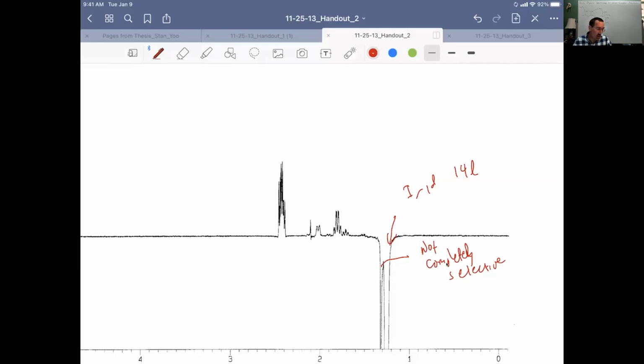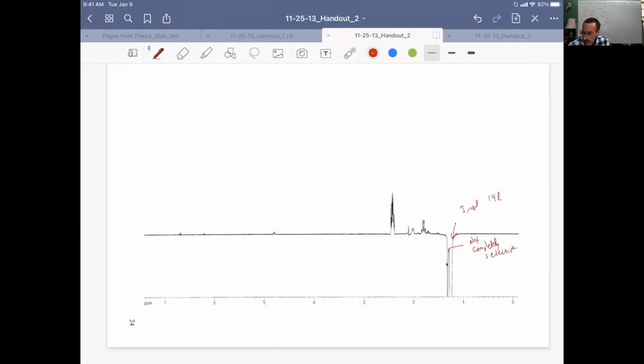Often I end up going for the isolated peaks. We're going to see there's enough information here, enough redundant information that we don't have to worry here.